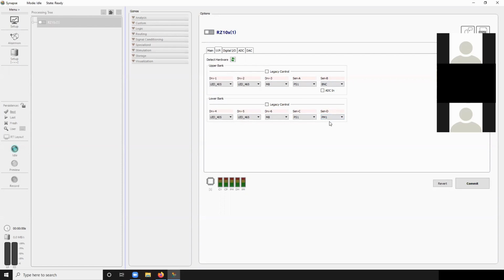So this PM1 is a power meter, and you can basically access that from the top bank or the lower bank. However, traditionally, when you add a photometry gizmo, which we'll see in a second, each row talks to only one photometry gizmo. So the only special device that talks across gizmos is this PM1.